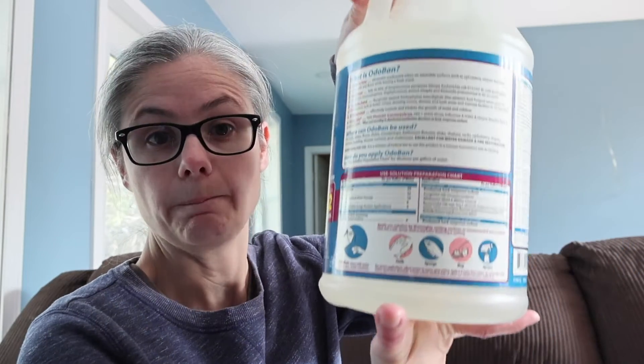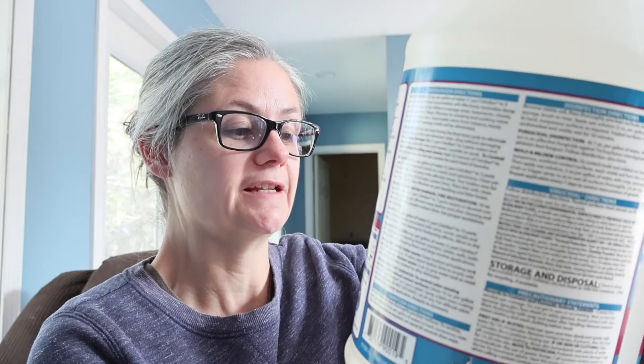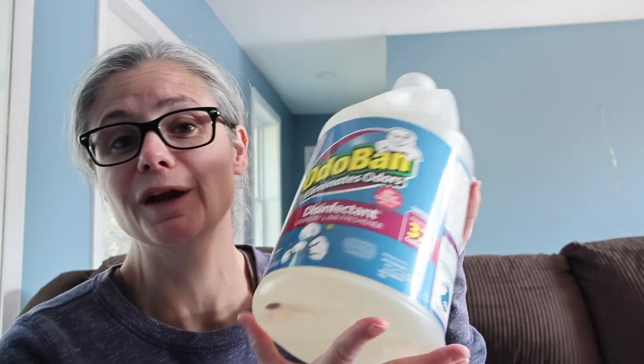Let's look at the directions on how to mop a floor using Odoban. I'm looking at the chart on the back for sanitizing, because that's what we're trying to do — test to see if it can remove bacteria. I'm going to pour five ounces of this concentrate into one gallon of water. It says it should remove 99.99% of germs in 60 seconds. I'll scale that up to one and a half gallons because that's what fits in my JoyMop mopping system bucket. Let's see how well the Odoban concentrate removes bacteria from my floor.